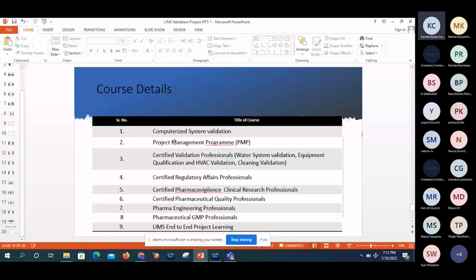Each and every balance is different. There is Mettler Toledo, Sartorius, different balances are there, right? Models are also there, so the parsing script will be different. Generally, in my experience, we always depend on the vendor for writing the script. Once they deliver the parsing script, we do the testing. Generally there is a global text, some subroutines and some coding involved in the parsing script. There is a table.